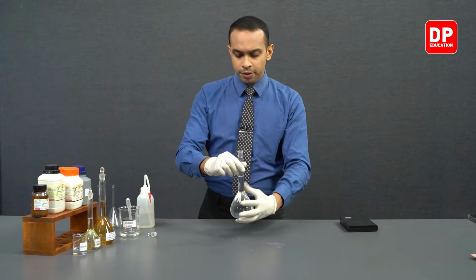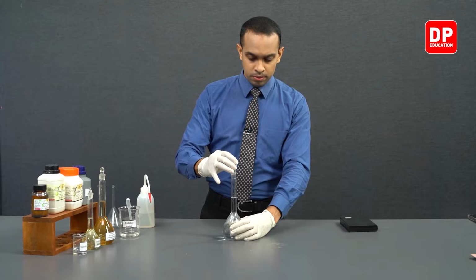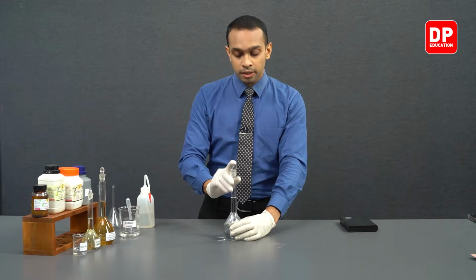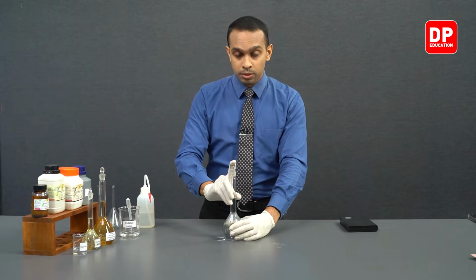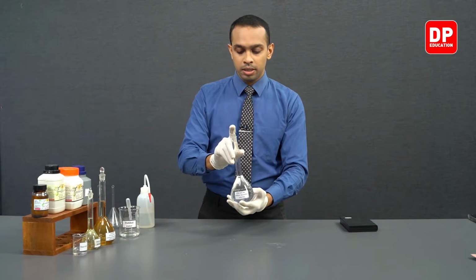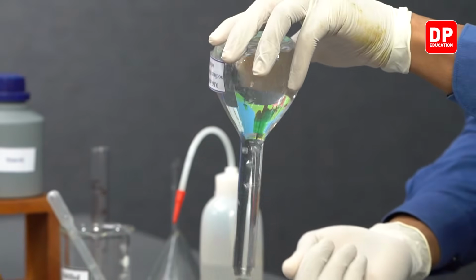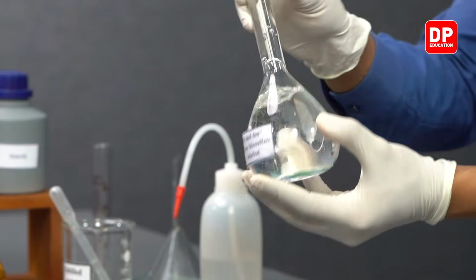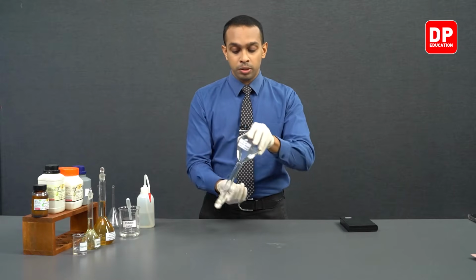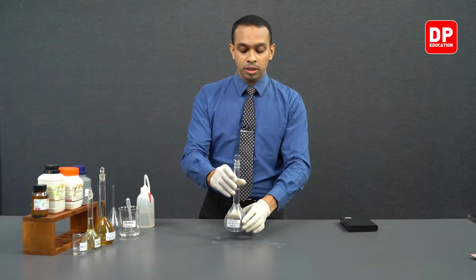Now, afterwards, you can place the stopper and closely tighten the stopper and place one finger on the stopper, and then we can start mixing the contents in this volumetric flask by turning it upside down a few times like this. This is to ensure that we produce a homogeneous solution where the concentration throughout the solution is going to be the same.